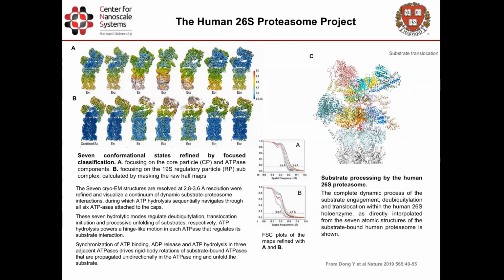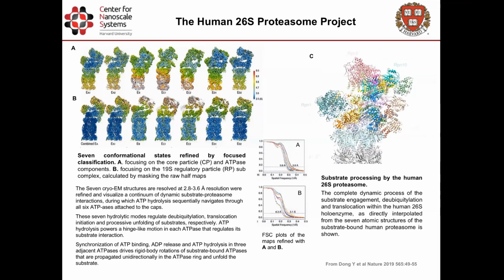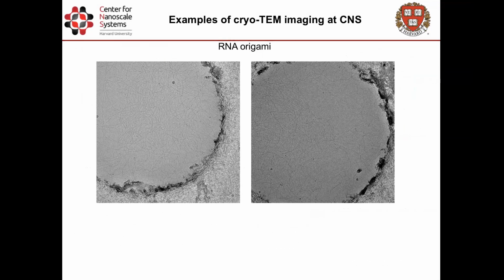However, as things stand, at the time, in 2017, except in Worcester, we didn't have a high resolution Cryo-EM microscope in Boston. Now we have 2 microscopes at HMS and 1 microscope at MIT. I'm not sure, Boston University is buying a 200 kV, and some companies have 200 kV. The nanoimaging service actually just built a company in Woburn, I believe. They have a couple of Krios as well.